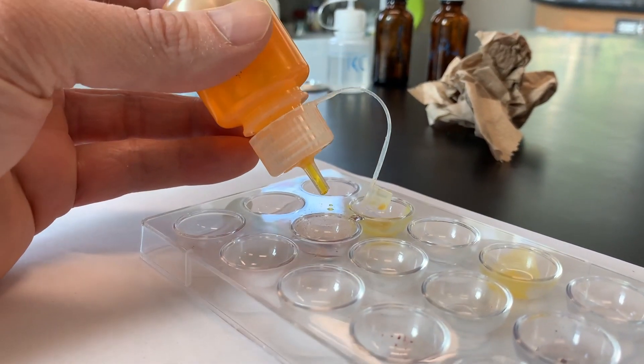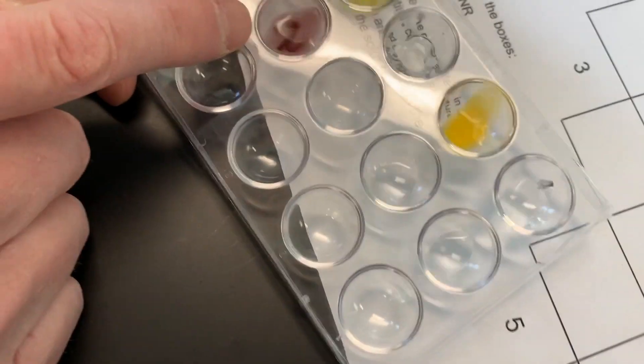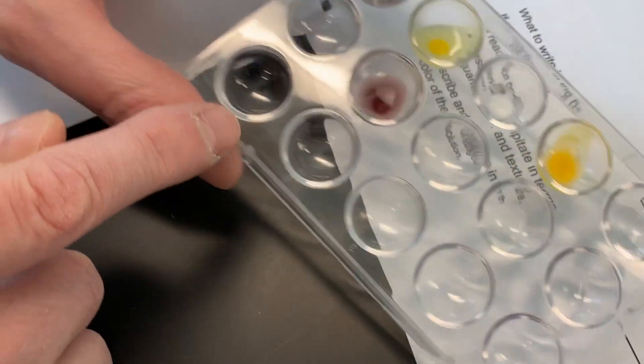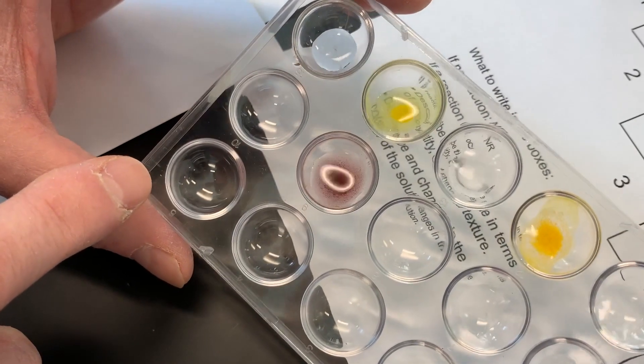One drop of sodium dichromate. Looks like a dark red powder and the solution is colorless.